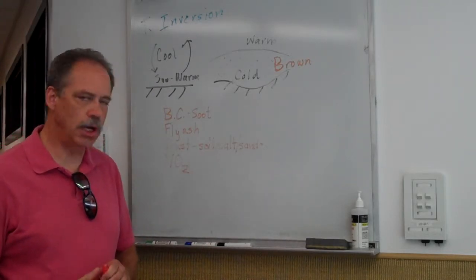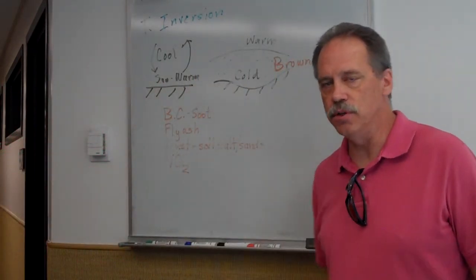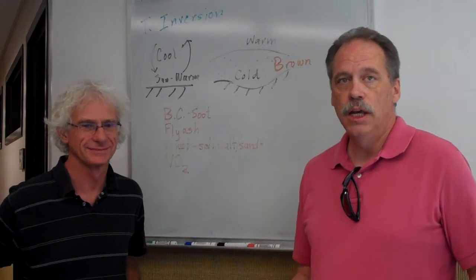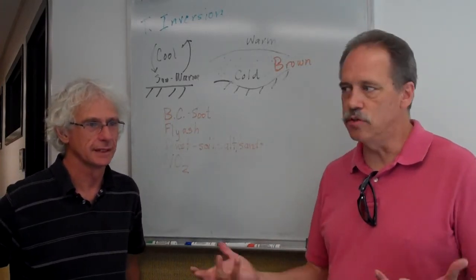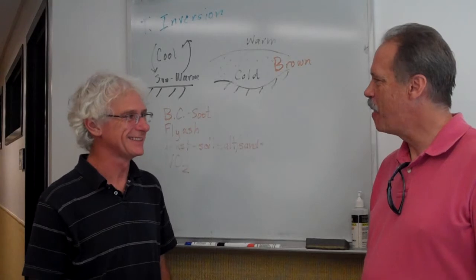So at this time I'd like to introduce our physical chemist here. We have the opportunity to visit his lab today and see how he generates this data and derives kinetics. He derives rate constants for different sorts of reactions. This is Dr. Jeff Tyndall. Jeff, thanks for working with us today. Thank you. Yeah, it's a pleasure.